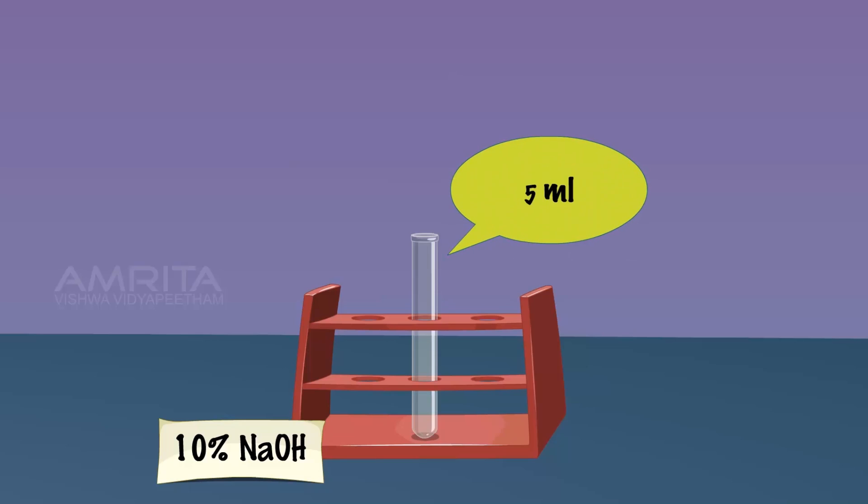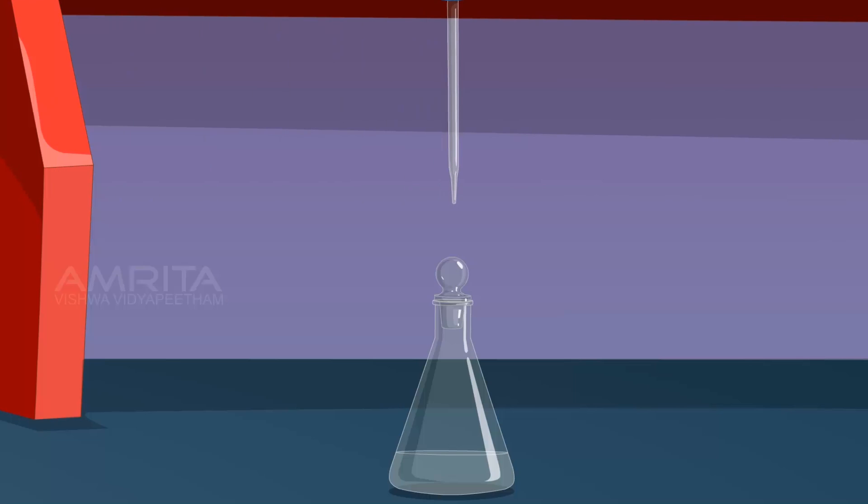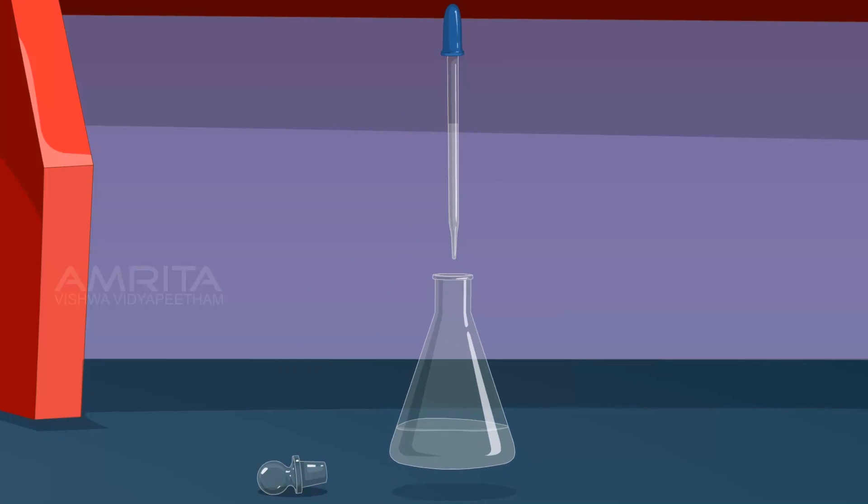Take 5 ml of 10% sodium hydroxide solution in a test tube and using a dropper, take the solution from the test tube. Add this to the conical flask drop by drop while shaking the flask in between each drop.